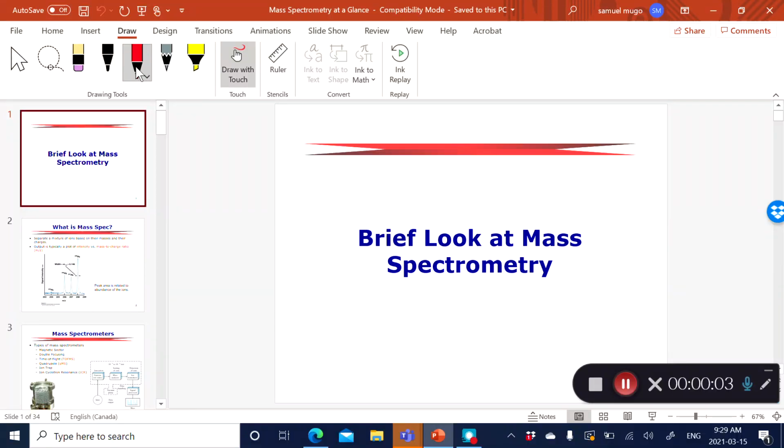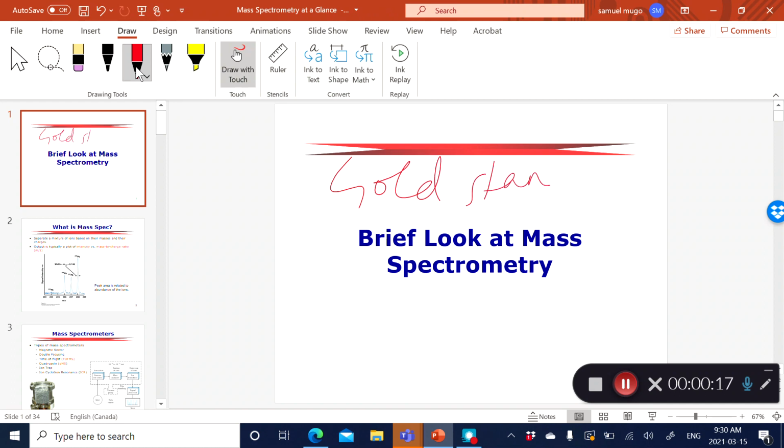In today's lecture, we're going to start the other topic or chapter that we need to cover, and that is mass spectrometry. And as you well know, mass spectrometry is possibly, I'm going to call it, the gold standard technique for chemical analysis.